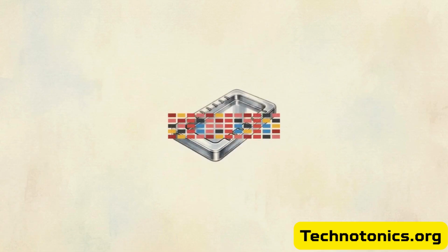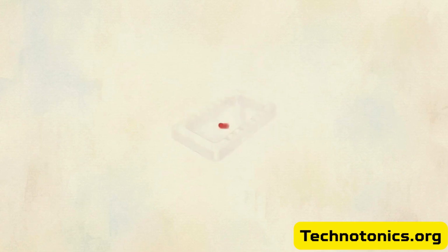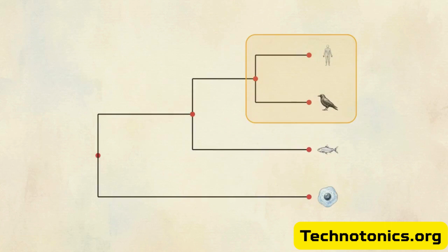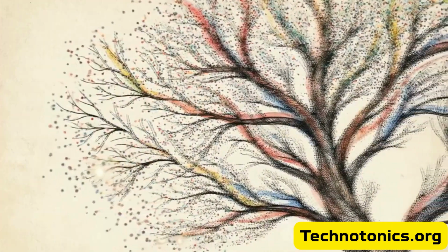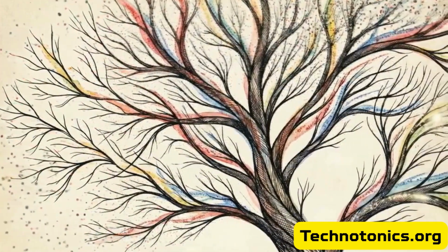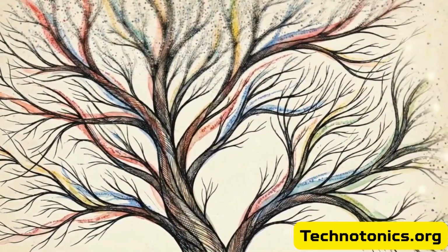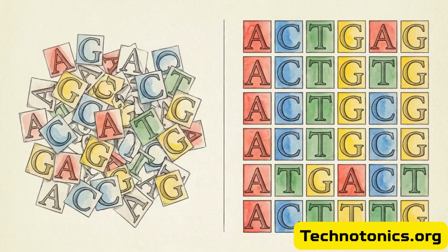From this alignment, you can also generate a phylogenetic tree. This visualization clusters the most similar sequences together on shared branches to show their ancestral proximity. By identifying these distinct visual patterns, you convert a raw jumble of abstract code into a structured map of our deep evolutionary history. You have now transformed raw, unorganized data into a high-quality multiple sequence alignment.